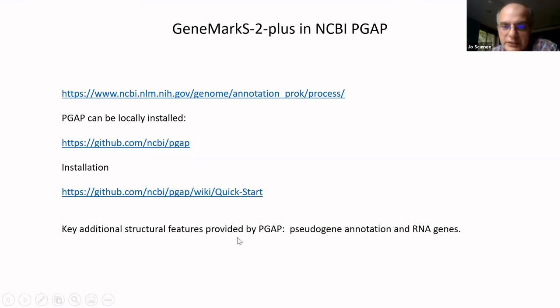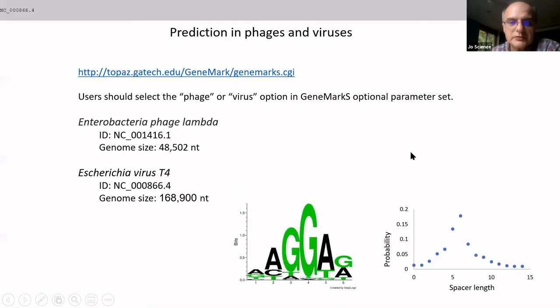Installation instructions are quite reasonable, but you have to follow them strictly. If you don't, the big pipeline will not work. Yes, it's not simple, but they are very responsive. If you have a question, you can send the question on GitHub, and an answer will be given to you quite fast if something doesn't work.